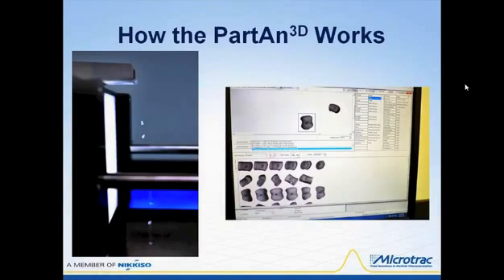This slide illustrates how the 3D mode works. The camera tracks the tumbling, rotating orientations of each particle, photo on left, and from those multiple individual images calculates the maximum and minimum parameters so that all 3 major axes are calculated.